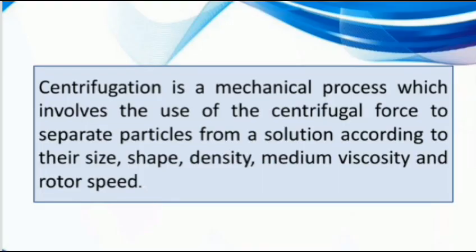First of all, what is centrifugation? It is a technique of separating substances by the influence of centrifugal force. What is centrifugal force? It is an outward force away from the axis of rotation acting on a revolving object. Basically, centrifugation is a mechanical process which involves the use of centrifugal force to separate particles from a solution according to their size, shape, density, viscosity, and rotor speed.